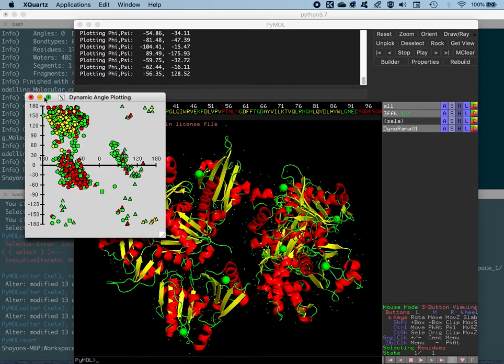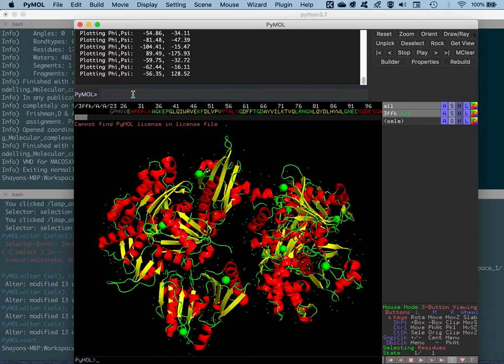So in order to generate, let's say, a high resolution picture, what you can do is close this again, and then we type in Rama all followed by none, which means we are not doing any kind of selection out here, and then a comma, followed by a name, let's say rama_plot.ps. Once you do that, if you're in the same workspace directory from where you opened PyMOL along with the structure, you'll find that the rama_plot.ps file is saved inside that directory, and you can open it with a PDF viewer and then convert it into different formats.